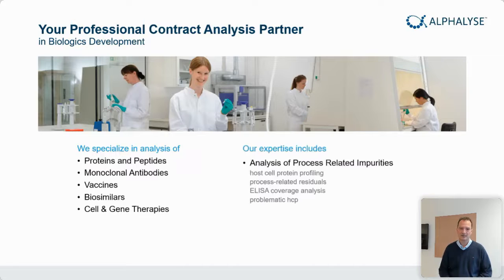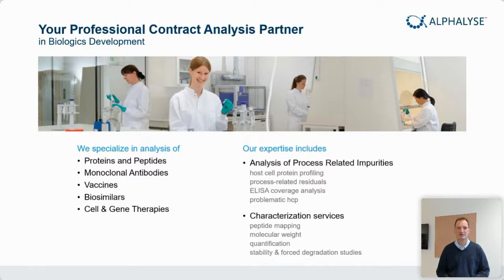The analytics we are doing is analysis of process-related impurities, HCPs, and also viral proteins in cell and gene therapy products, as you will hear about today. We have different analytics for these impurities listed here. We also do classical characterization of the drug proteins itself. These are typically peptide mapping, intact mass analysis, quantification methods, and different analyses for forced degradation studies that I will not come into today.